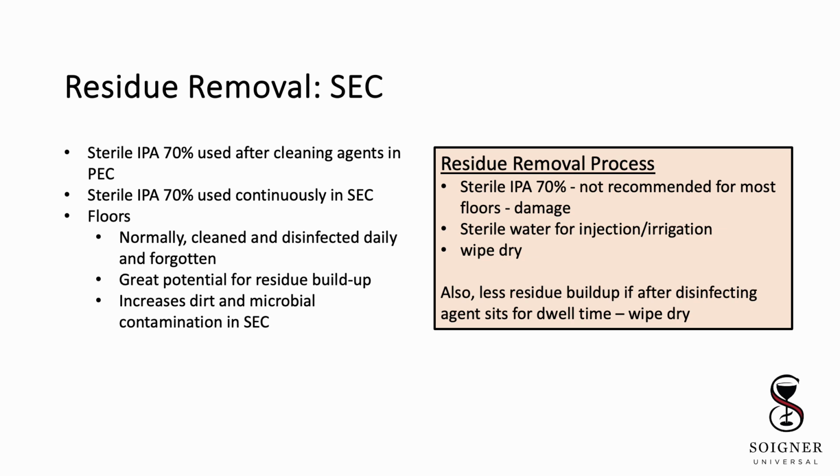However, the use of sterile IPA 70% throughout the compounding day to help maintain microbial control also removes residues from these surfaces. The surfaces that lack attention on a regular basis are floors. It will be necessary to remove residues from floors on a regular basis. If not done, the floors will become sticky like a tacky mat and collect dirt and microbial growth, essentially introducing microbial contamination to your environment.